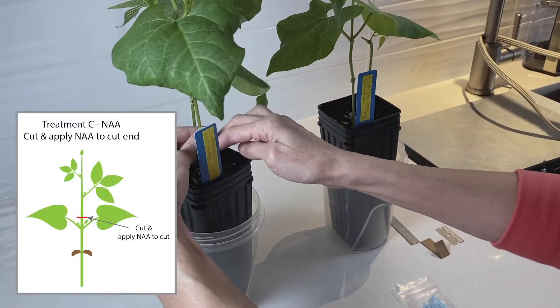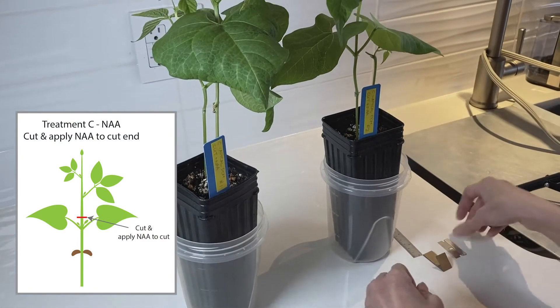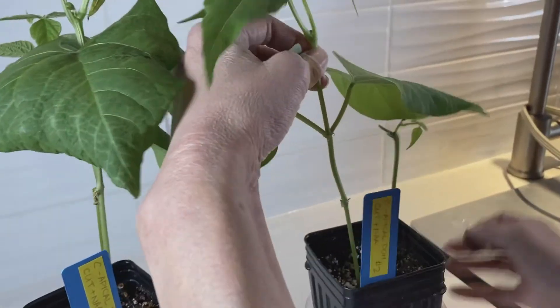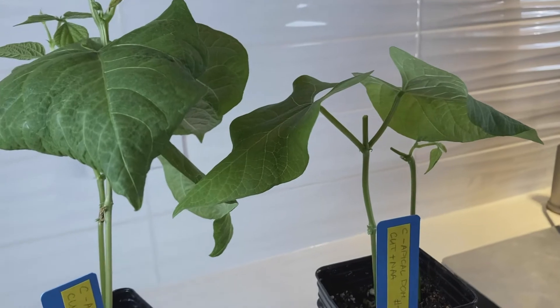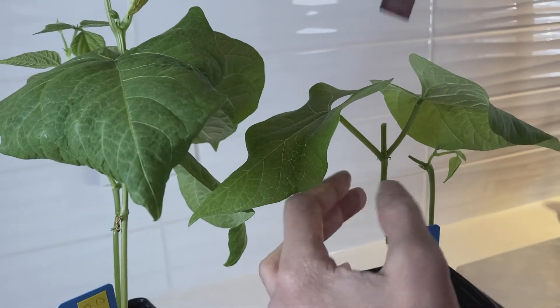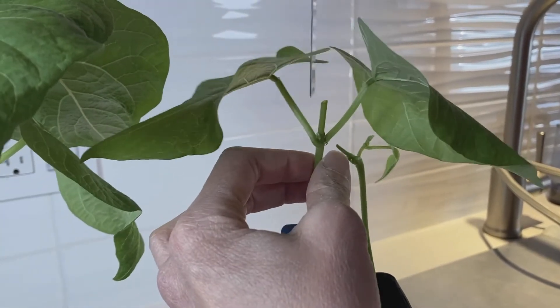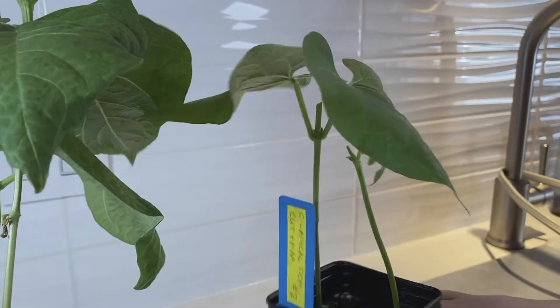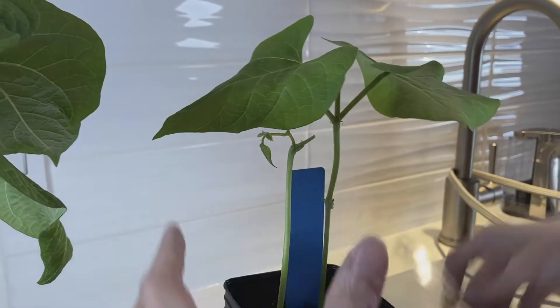For treatment C, we are also going to cut the stem about one centimeter above the primary node. We'll cut this one and discard that. Make sure you measure your lateral buds — these are quite small, so measure carefully and record it in your chart. The other lateral bud is easier to see on the other side, so measure that one too.